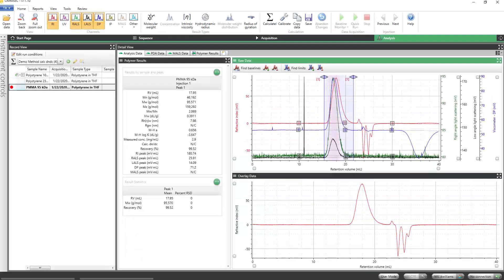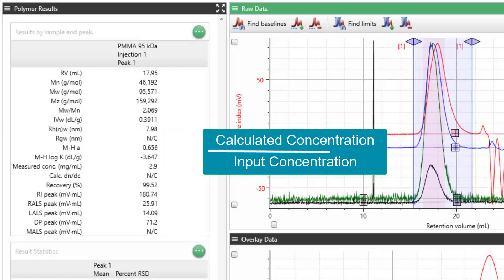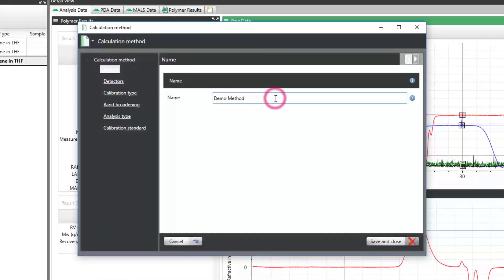In this and the previous analysis type in which a known DNDC value is used, the calculated sample concentration will be compared to the input concentration to provide a percent recovery. Regardless of which one you are using, it is a good idea to edit the method name to reflect the analysis type in use.